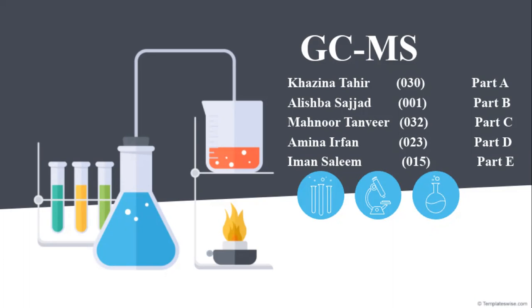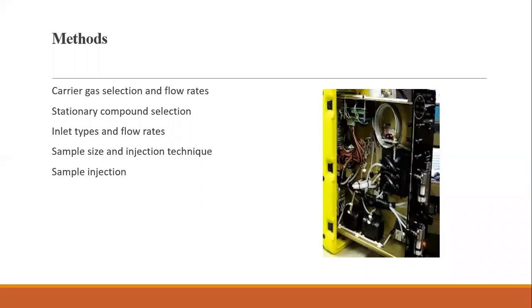Today I am here to present three topics from gas chromatography. Here are some of the methods: carrier gas selection and flow rates, stationary compound selection, inlet types and flow rates, sample size and injection technique, and sample injection.